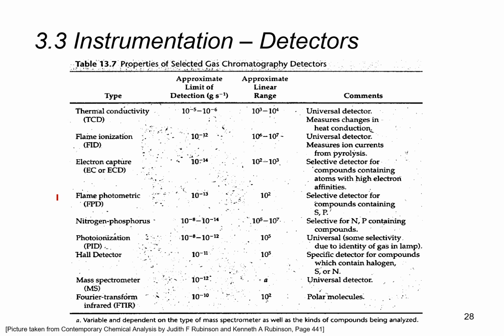I guess it would be important not for us to memorize these different detectors, but to understand that for different types of compounds, there are different types of detectors, and this is based essentially on the advantages and disadvantages that each of these detectors bring.